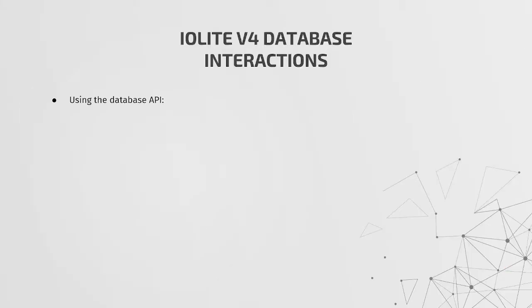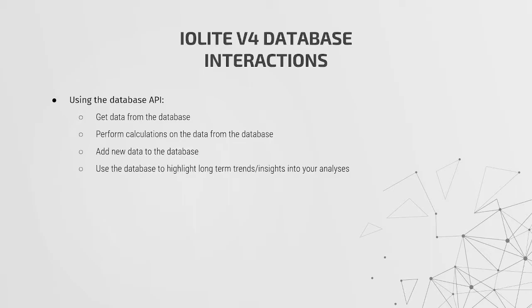In today's presentation, we'll be looking at how to get data from the database so that we can perform calculations on data from the database and potentially also add new data to the database. Using these simple concepts, we'll use our database to gather insights into our long-term trends within our database.